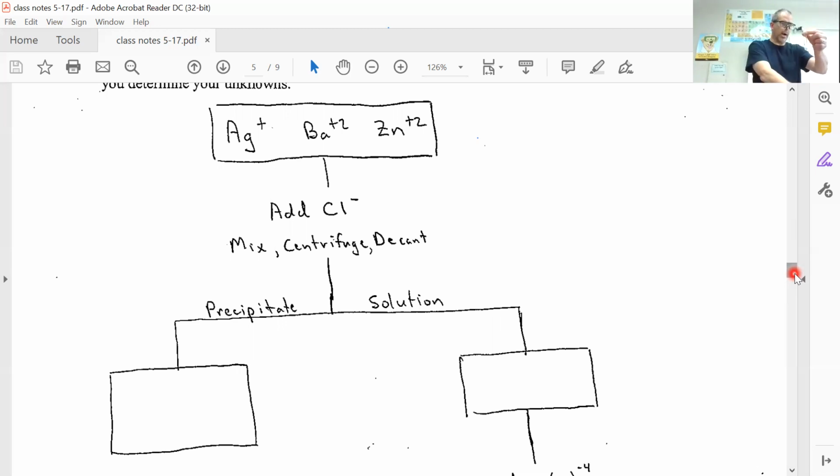So adding 10 drops. Now, sometimes it says in there to give it the knuckle, or you can mix it with your finger, but you want to wrap that around and mix it real good. And now it almost looks like chunks in there, like cottage cheese or something, that's kind of sinking to the bottom. So what happens is, if I add the Cl minus and mix it, now I want that to separate better. Okay, so what I'm going to do is centrifuge it.